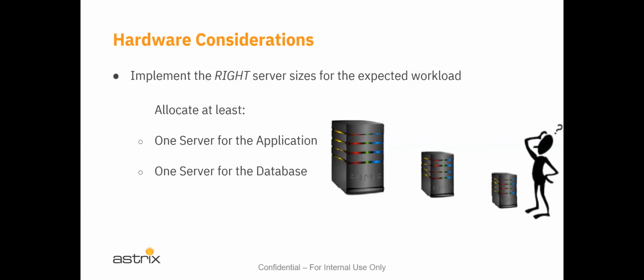So the amount of traffic in terms of data that is going to be processed by the STARLIMS system really needs to be considered in terms of what hardware they're going to require on the STARLIMS side to handle that. And the entire topic of load balancing, and we'll talk a little bit about that in a moment here, comes into play, right?